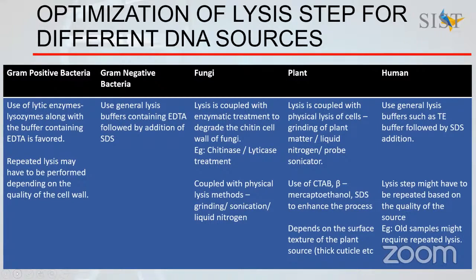So in gram-negative bacteria, we normally use the general lysis buffer, which contains EDTA, followed by the addition of SDS, which is sodium dodecyl sulfate, a detergent.